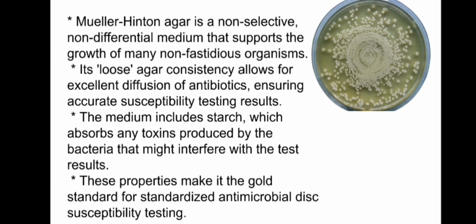And the medium includes starch, so this is a key factor. Because of the presence of starch, any toxin that is produced by the bacterium is absorbed into the starch, and thus it doesn't interfere with the antibiotic being tested for susceptibility, which was favorable to the testing community, so they made Mueller-Hinton agar the standard.